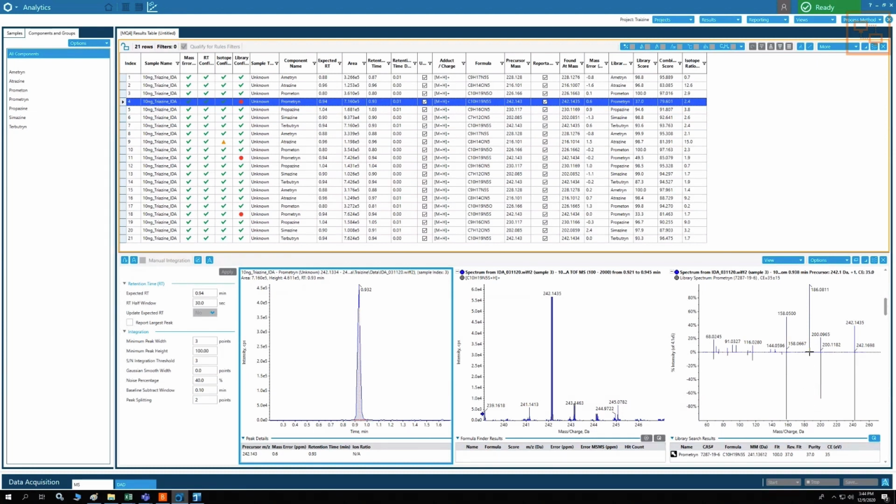Yes, exactly. Okay, great. So that's correct, but unfortunately that's only half the answer. So now we need to understand why. So what is going on? This is IDA data. IDA should be clean MSMS, right? We are selecting specifically the parent. We are selecting 242 in the Q1, and we are fragmenting that into Q2, and these are all of the daughters from 242. We have a beautiful clean XIC, right?